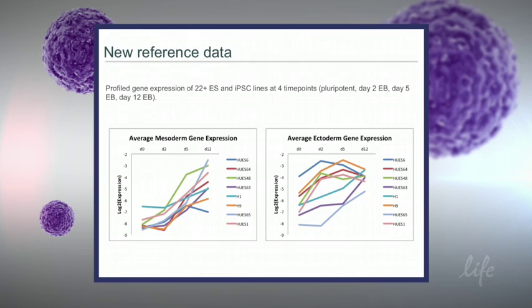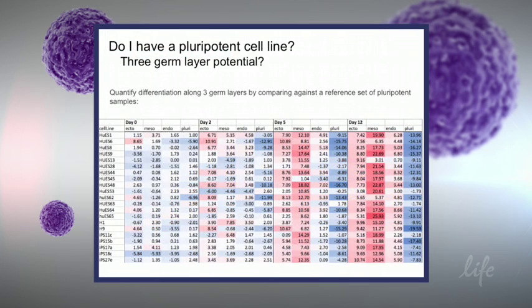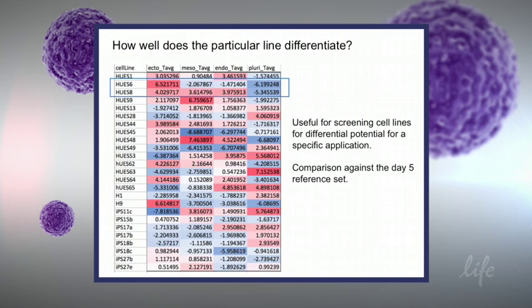You can see very rapid and interesting dynamics and induction of these different gene sets for the different lineages, and again, you can see the same thing for mesoderm as well as ectoderm, showing that these genes are quite nicely induced during the differentiation. In fact, you can zoom into this a bit more, color-coded in this previous way. And so again, this is coming back to the first question, where again, do we actually have 3 lineage specification in these?